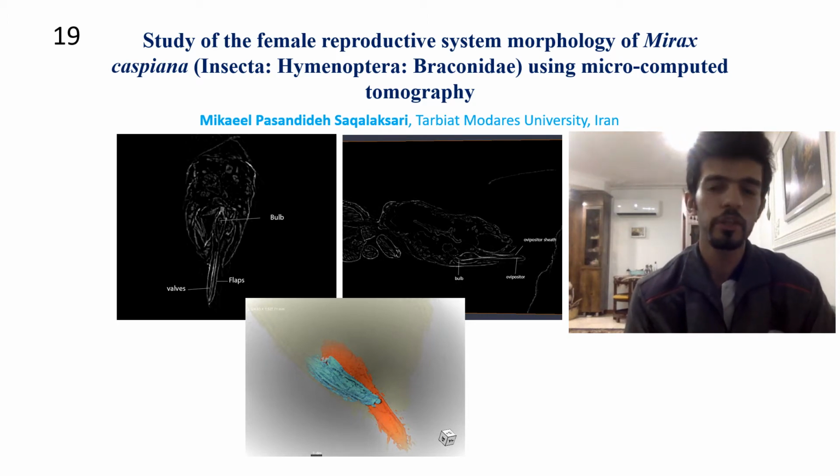High-quality volume rendering images and videos represent a notable advance in morphological structures study and are a helpful tool for future research and education.